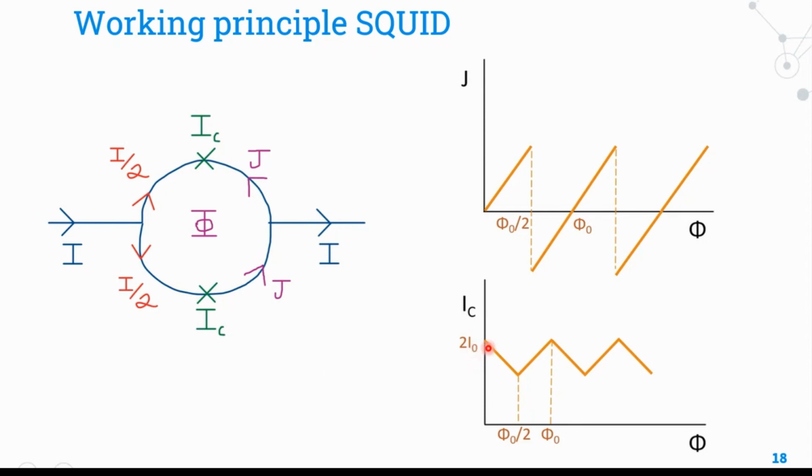This will decrease to the half quantum number, and then increase again to the integer quantum number, and this will show up as an oscillating function. So using this concept, we get data from this DC SQUID. This current is related to the phase, the current is also related to the same phase changes, and this phase is related to the magnetic field, the magnetic flux.